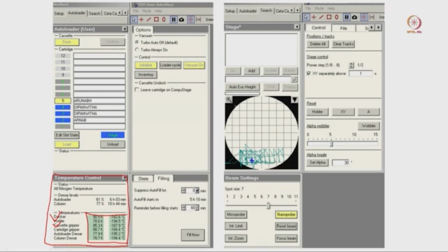Now, this is the trajectory I am talking about when we are talking about that imaging. Your sample area is looking like this. This is called the entire sample area or grid, and this is the trajectory I am going in a different direction and selecting which area I want to image at high magnification. You can follow any trajectory, no one is stopping.